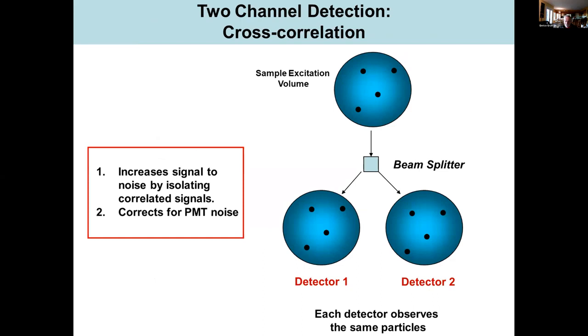So let us go very rapidly to other things. One example is what happens if you have 2 detectors. If you have 2 detectors, and one detector, for example, is sensitive to one kind of molecule and the other detector is sensitive to the other kind of molecule, then detector 1 and detector 2, see, those are different molecules, the fluctuations will be independent.